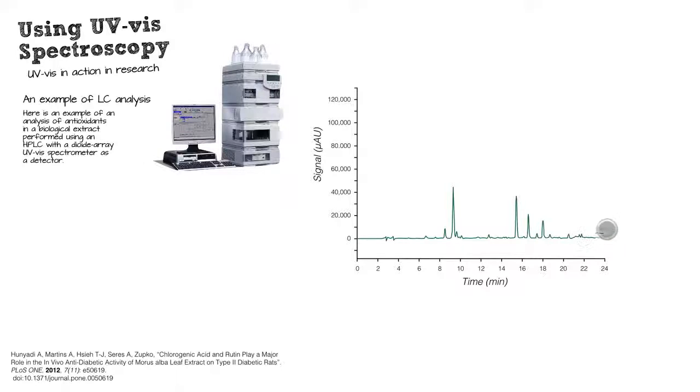But we don't have to look only at that wavelength. Modern HPLCs will have what's called a photodiode array detector, where you're spreading the spectrum across a chip, and at various points in that chip you can look at all the wavelengths that are accessible. So what if we looked at a slightly different wavelength?